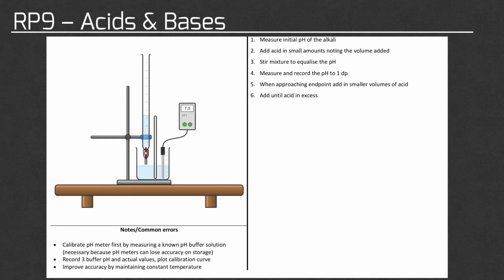Once you've done that, you can begin the practical, in which you'll measure the initial pH of the alkali being used.